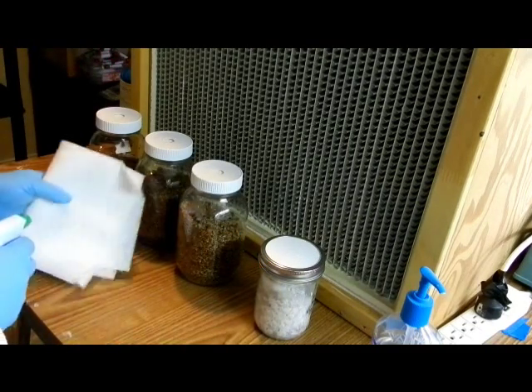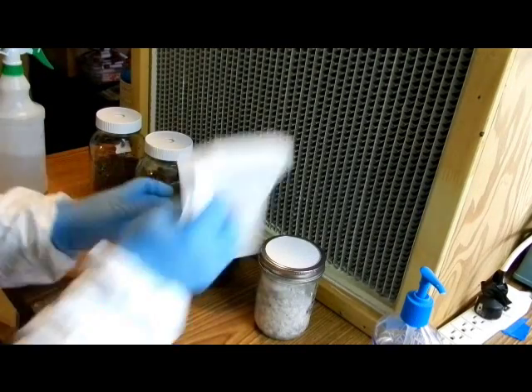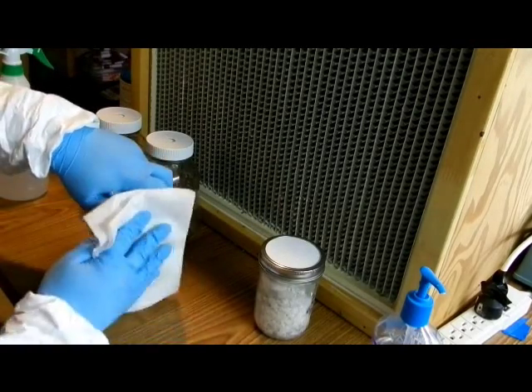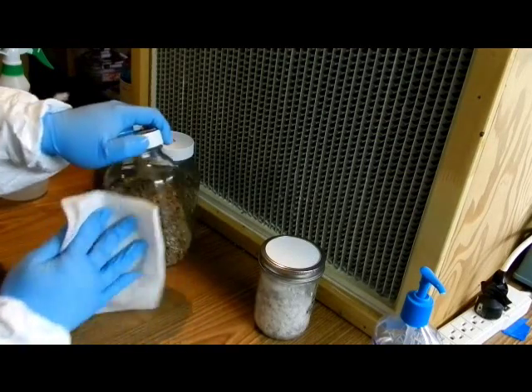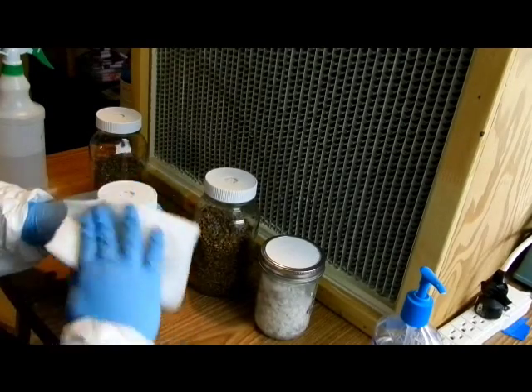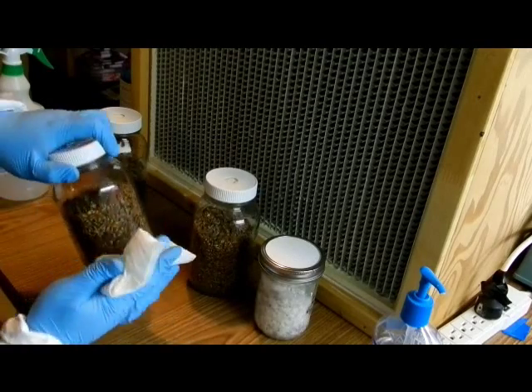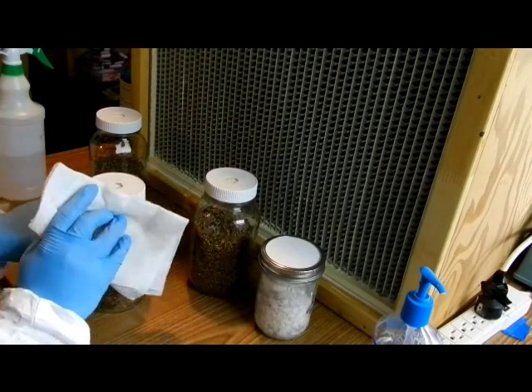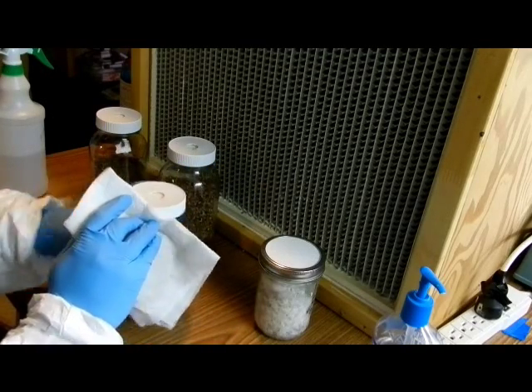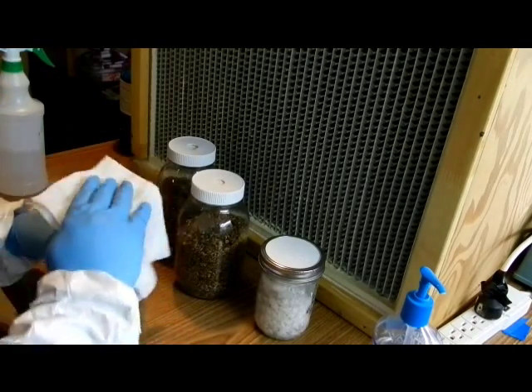Here I am spraying down some kitchen towel with some 70% isopropyl alcohol. What I'm going to do is rub down the donor jars just to sanitize them, making sure to get the entire jar. I'm going to focus on the spot in between the jar lid and the jar. I forgot that jar — I'm going to go back and do that now. And the last jar.